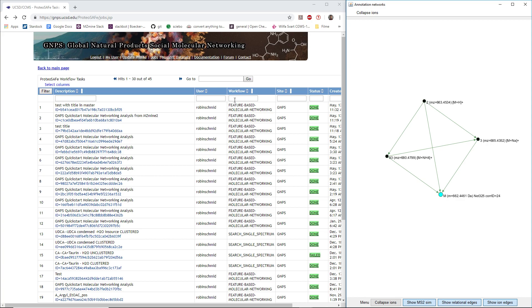This video is going to focus on the visualization of feature-based molecular networking results and of the results of Ion Identity Networking. It's very important that we submit the data — we can do this from MZmine directly to GNPS — that we do this before we run Ion Identity Networking, or that we just don't submit the additional edges.